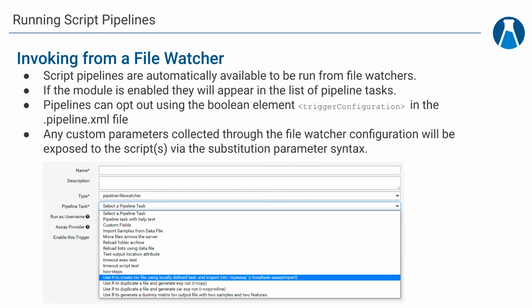When we've defined our pipelines before, they'll show up in this list and allow us to execute through there. Within this dialog, there's another section where you can provide any parameters that would otherwise be necessary.